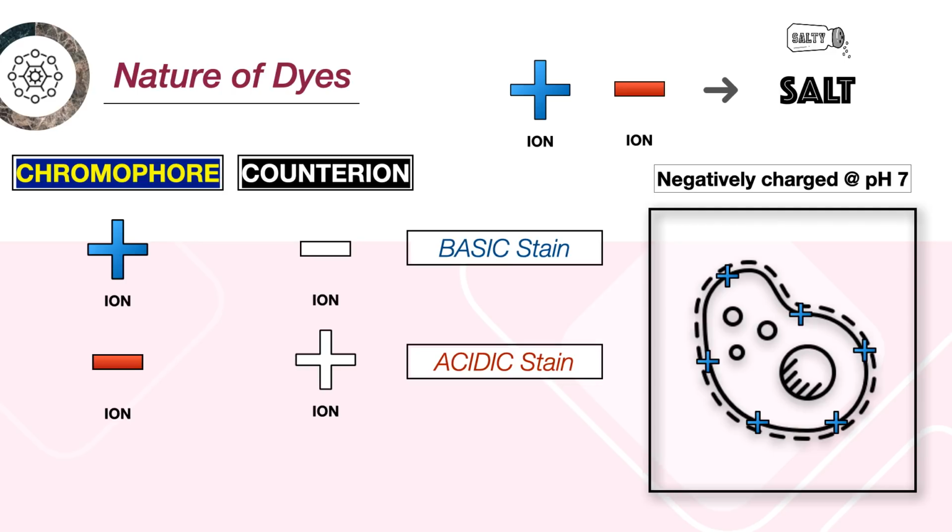Rather, your acidic stain, if not the bacteria, it will stain the background. Okay, it will stain the background. Okay, this will make more sense later. Okay, basta alalahanin nyo yung particular na ano na yan, ha? Particular na concept. Huwag nilang kalimutan.